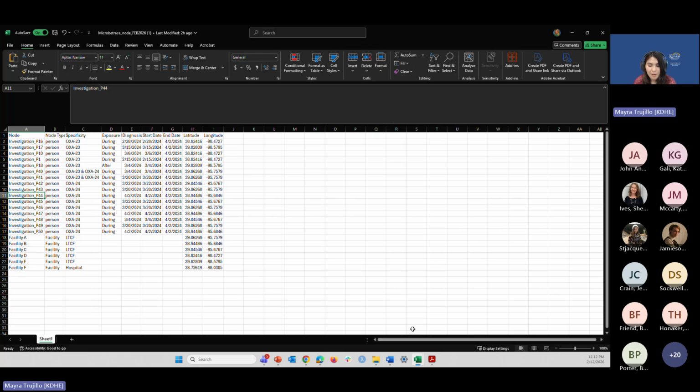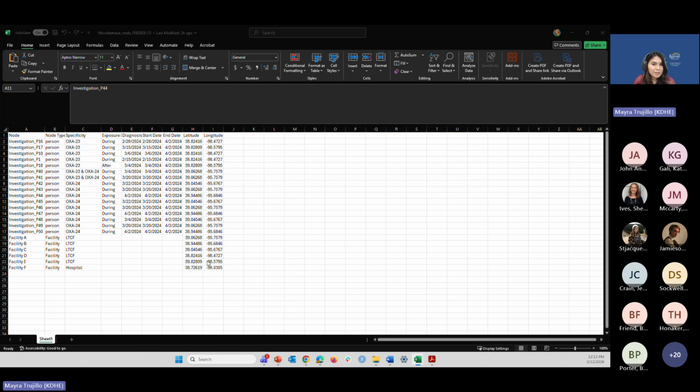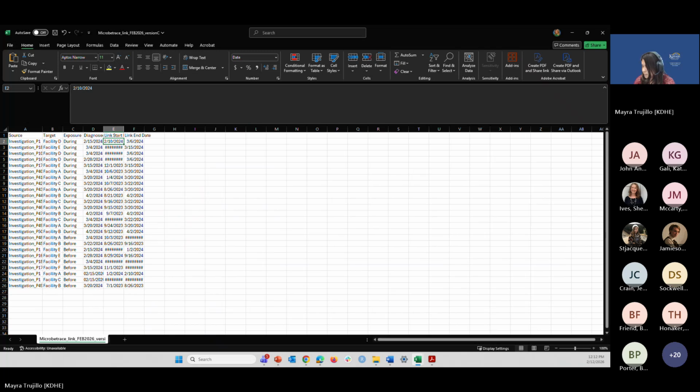Now, we'll talk about the link list, or the edge list. So as a reminder, an edge list is the linking data.